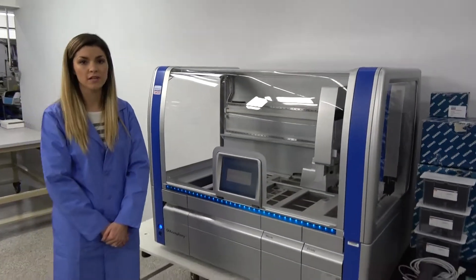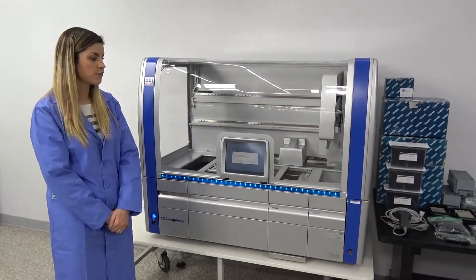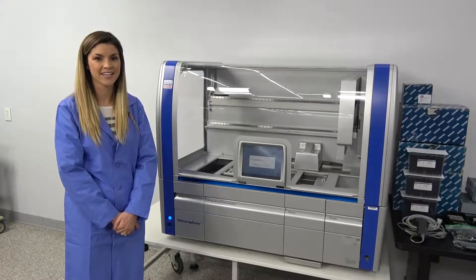We do have this unit available. It is in our Pridersville facility and we offer it as a fully functional machine, and it is available with a 90 day warranty. So if you have any interest, just give us a call and we'll talk to you.